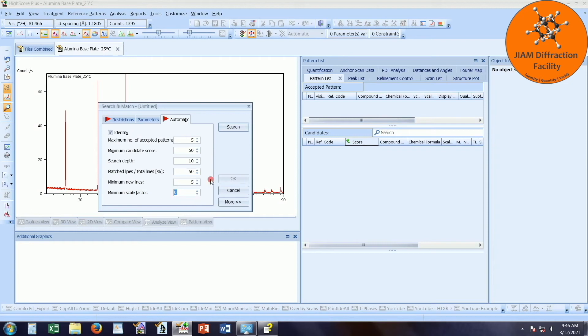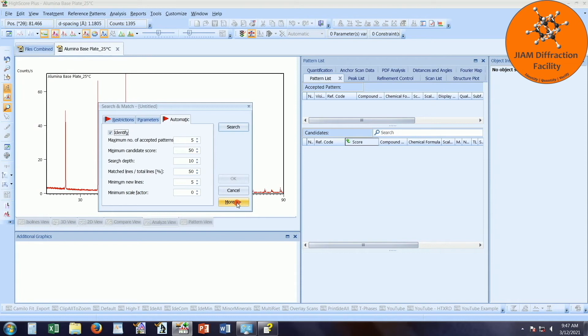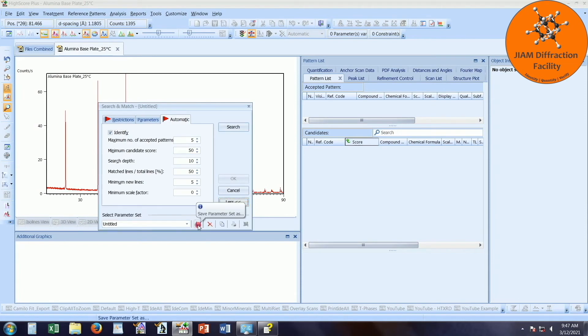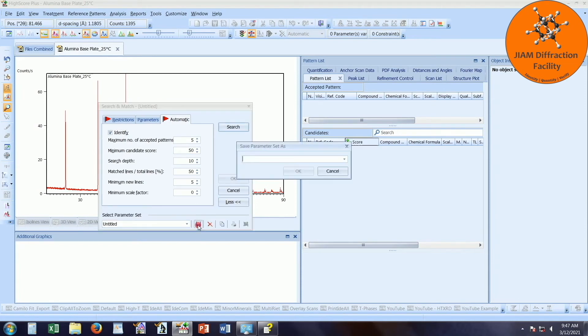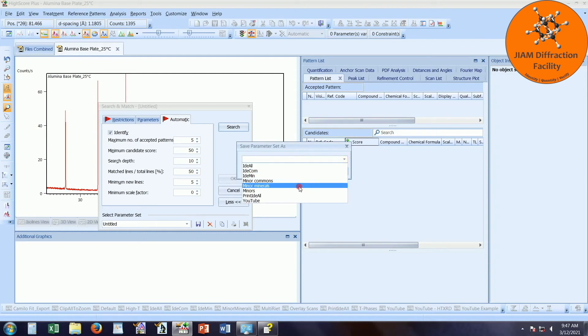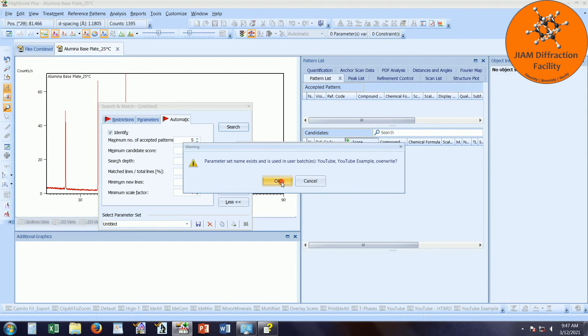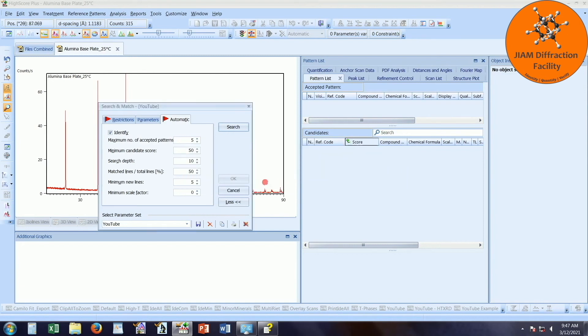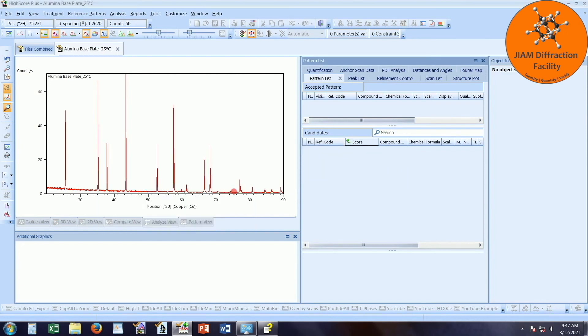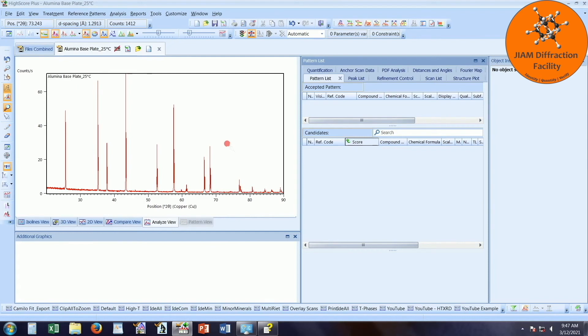Now once again, if these values don't seem to work well for you, you can play with them and determine what does work best for you. And then once you have that figured out, you can click more and save all of this as another parameter set. I will once again choose YouTube, OK, and OK. And now we have all of the parameter sets that we need in order to perform phase identification through a batch process.